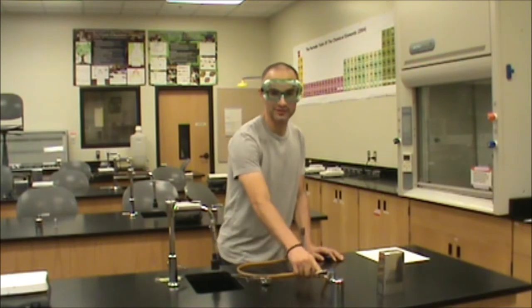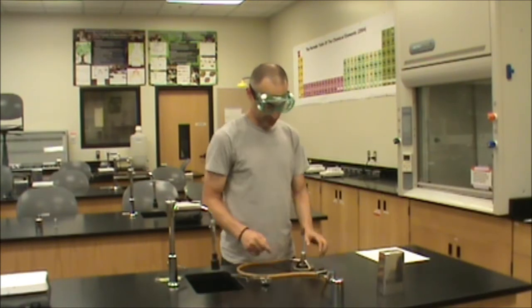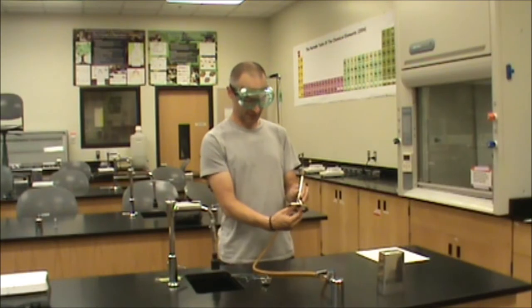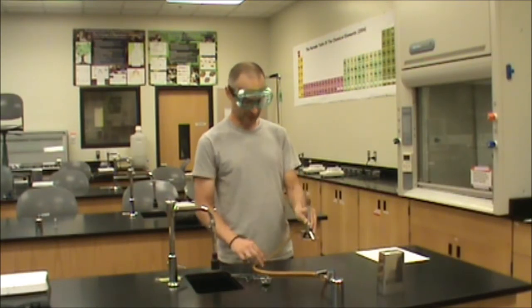You want to connect the Bunsen burner to the gas jack located at the front of your workstation. You want to make sure the valve at the base of the Bunsen burner is turned on at least a few turns.